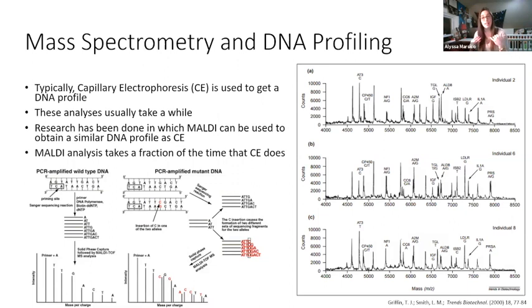So my grad student and I, we both have very similar hair. We looked at it under the microscope, very, very similar morphological characteristics. So if we can't do DNA, an analyst may say they're indistinguishable, right? I can't tell if they come from different people or the same person. Rather than that being it, you send this hair sample to be analyzed by GC Mass Spec. And because proteins are directly related to DNA, we can still get unique information from it, right?